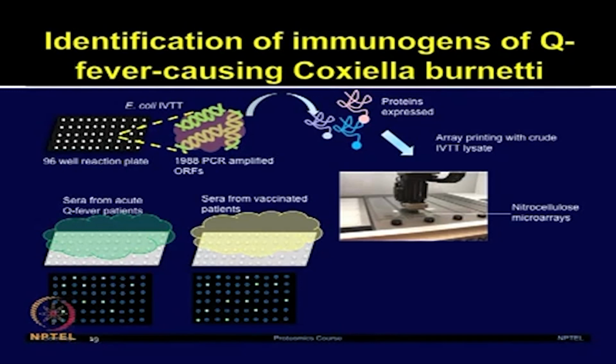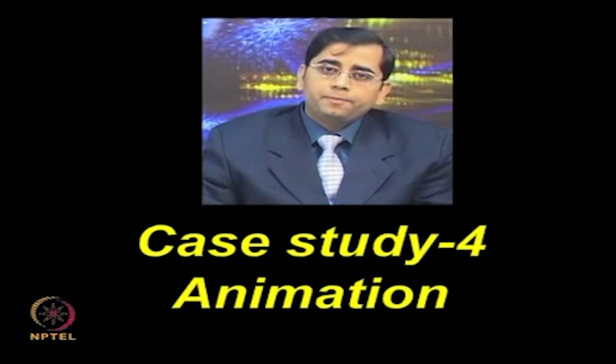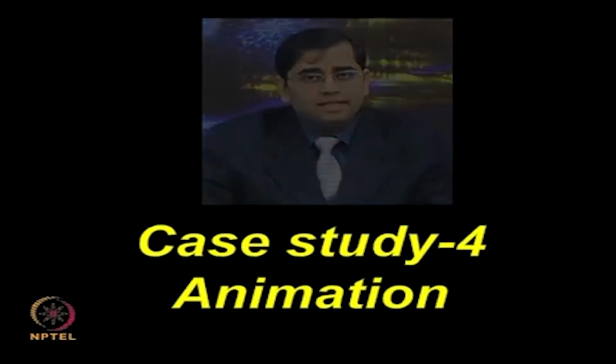Almost 2000 open reading frames were generated by using the cell-free expression based approach, the E. coli IVTT system, and then employed this protein microarray platform for identifying the immunodominant antigens. So, some of the steps involved in this experiment will be discussed in the following animation.